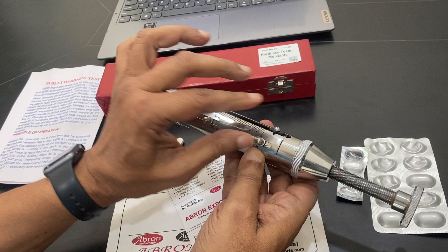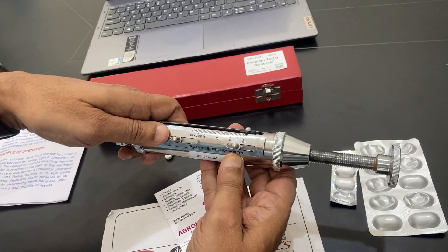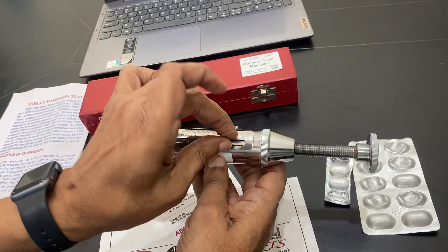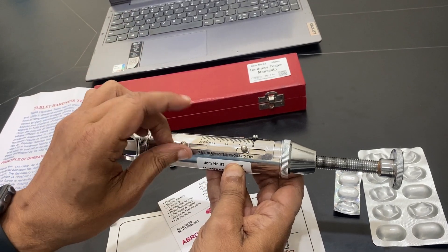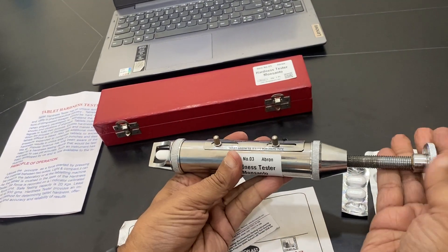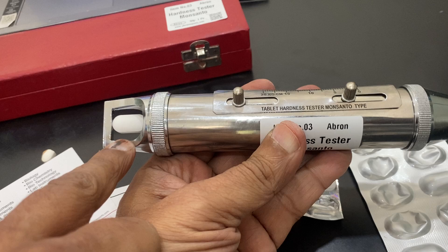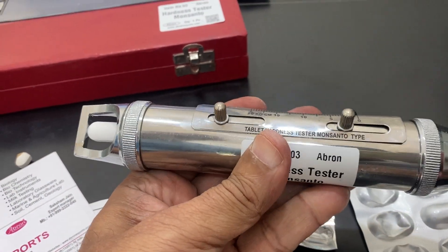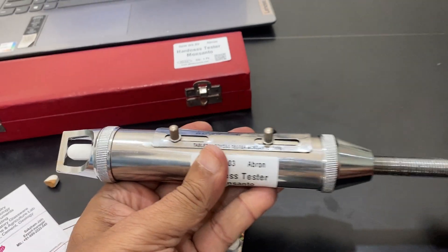Then you have to open these two screws and adjust them to make it zero — this means no pressure. I have adjusted it. Now slowly I tighten this and slowly rotate it. Carefully check the reading. I am just rotating this knob.